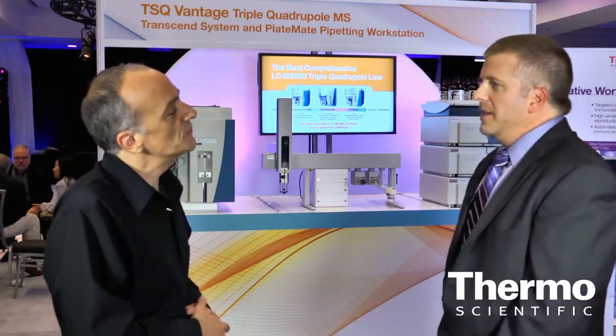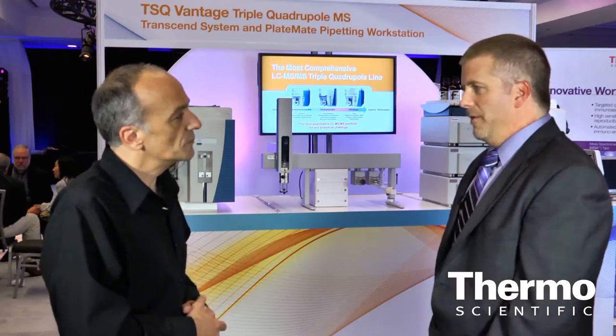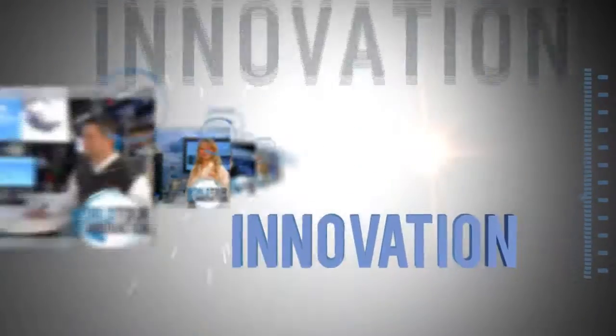What it all adds up to is Thermo Scientific offers the best triple quad in the market for quantitation. Learn more at thermoscientific.com/TSQ.